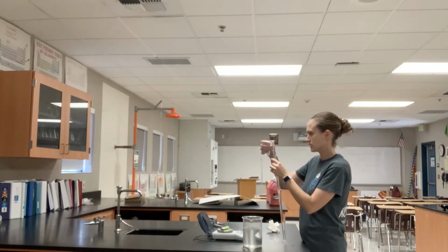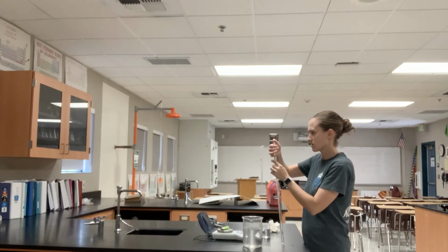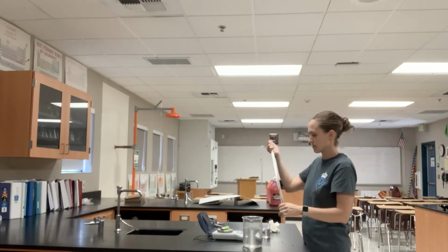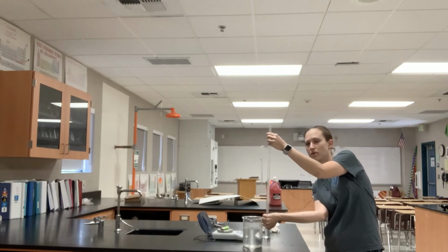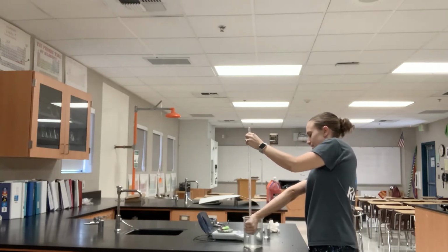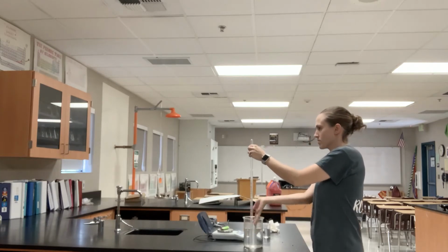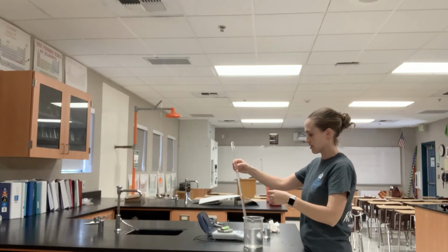Okay, I'm going to spill a little bit onto the counter, that's fine. Now I'm going to cover the opening with my finger and flip it. If you notice, there are no gas bubbles in my eudiometer right now. Okay, I'm going to very awkwardly put it into the big beaker of water. And now I've got a eudiometer that's full of water with no air bubbles.